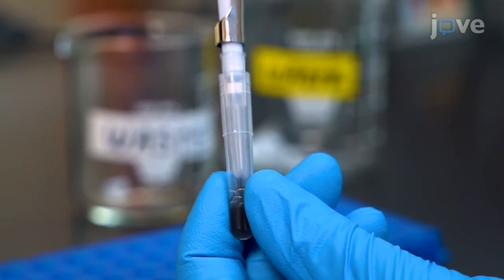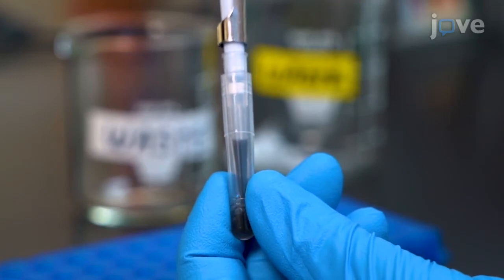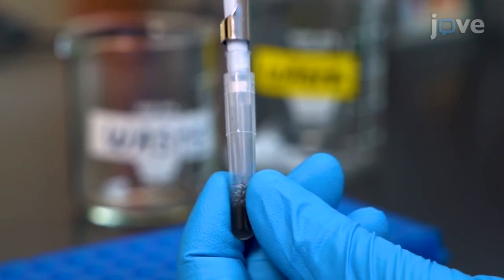Using a pipette, mix the lysate and the magnetic beads mixture for 10 to 20 seconds. Then let it stand for 10 minutes at room temperature.